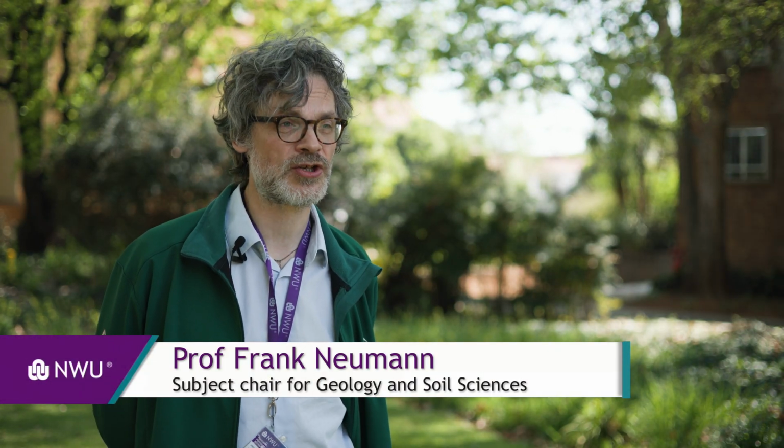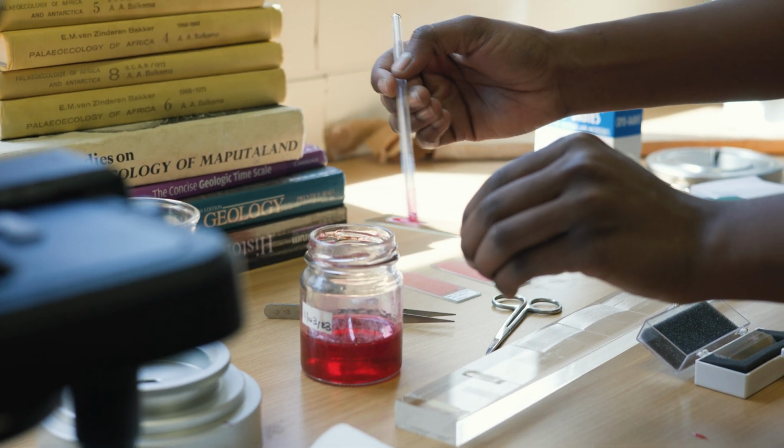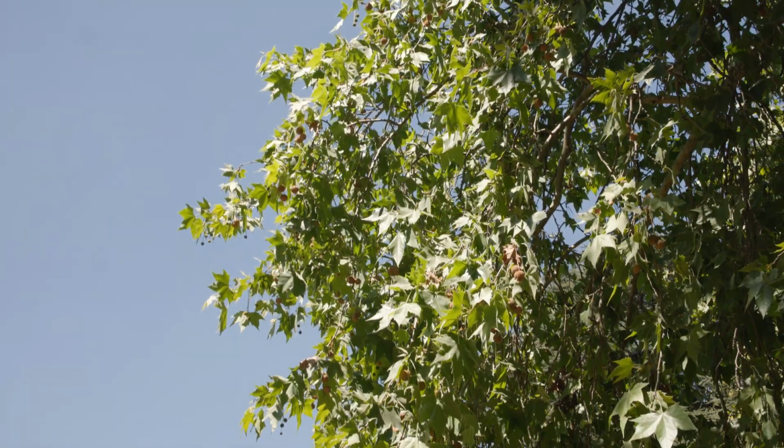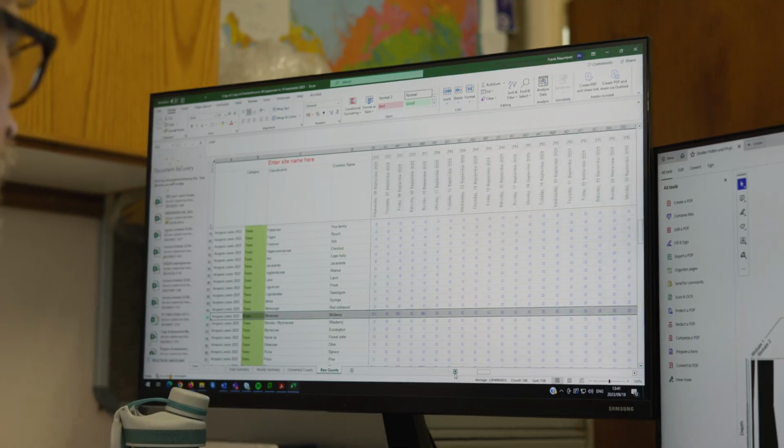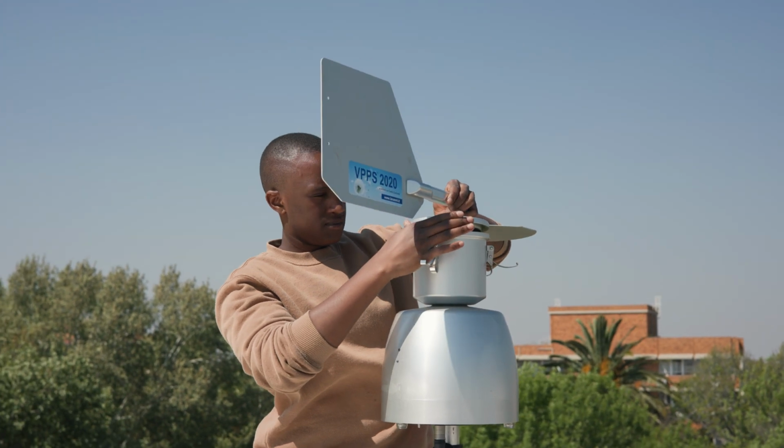In our field, aerobiology, it's about measuring pollen and spores in the atmosphere, which can cause allergies. And you all know hay fever, so you're all aware that at the moment we are in the flowering season of many trees. And so we are at the moment focusing on those trees, and we are measuring in our spore trap here on one of the buildings here on campus directly which kind of allergenic pollen you're exposed to.